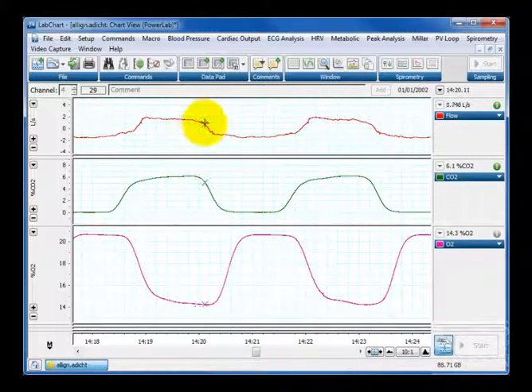If I hold my mouse cursor over where I believe the end of respiration is, which is here, the point of cessation of flow, you can see that the O2 is pretty much on the nose for end tidal. You can see it's pretty close to the end tidal measurement, but the CO2 you can see seems to have preempted this, and we've got a reading which is slightly in advance of our end tidal.